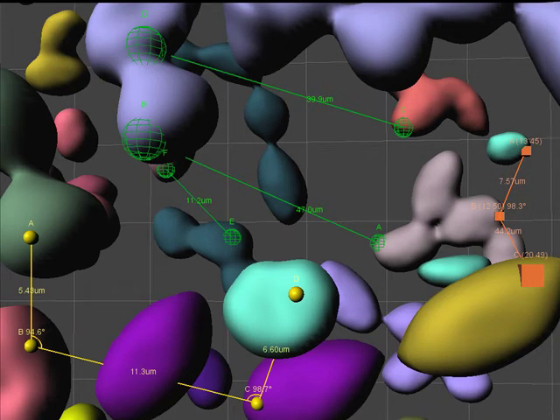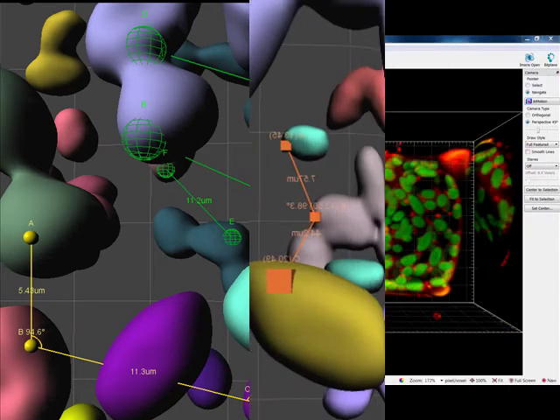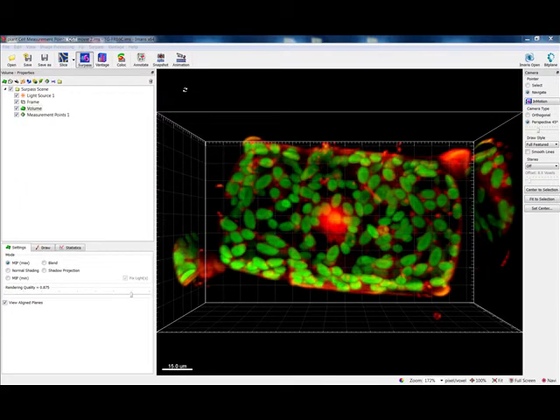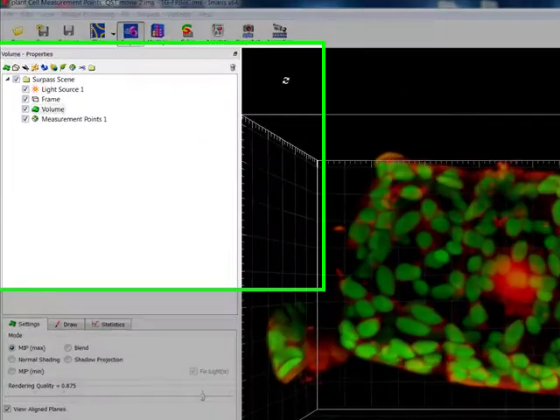This tutorial describes how to place measurement points on a specific plane when it lacks any created object such as spots, surfaces or filaments, or even high-intensity voxels.